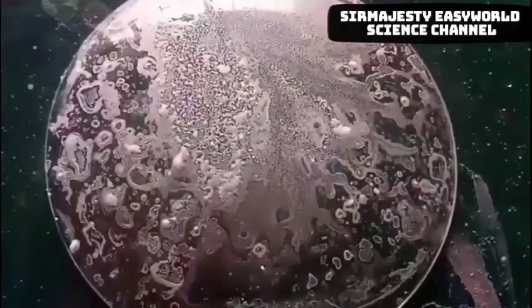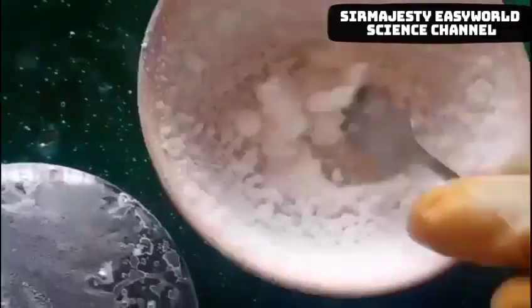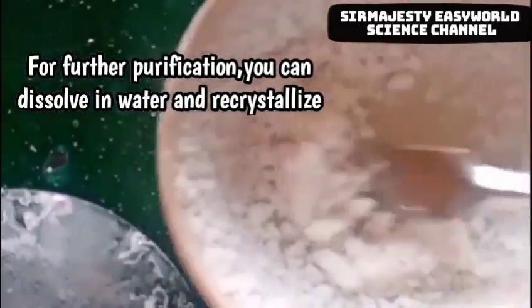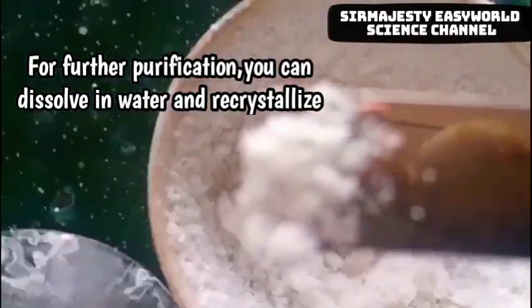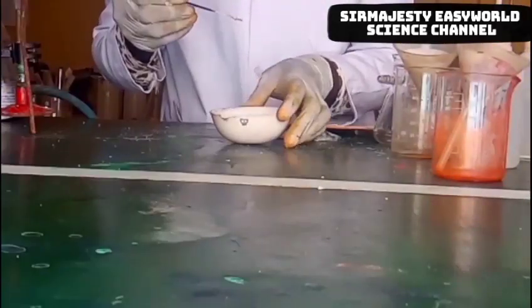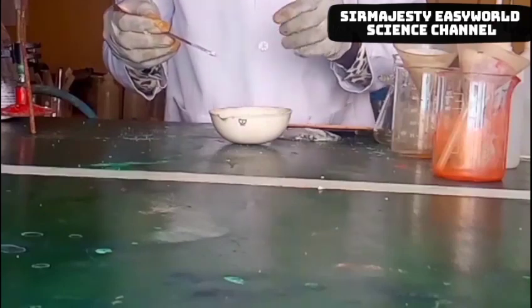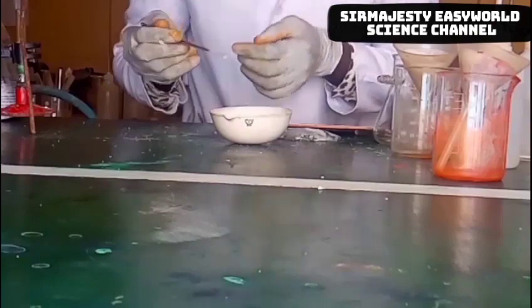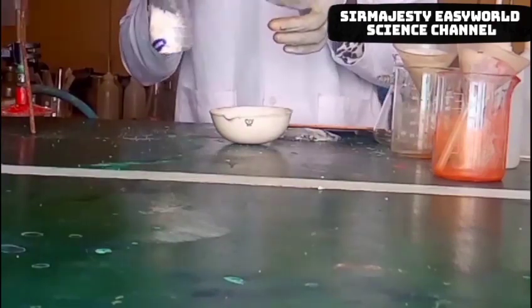After cooling, you gently bring down the crucible and scrape out the sodium chloride from it. As you can see, we have clean sodium chloride particles — this separation is perfect, pure enough for consumption. For further purification you can dissolve it in water and recrystallize it. You can see it is very clean. I tested it and it tastes exactly salty, just like the salt we have in the sachet.